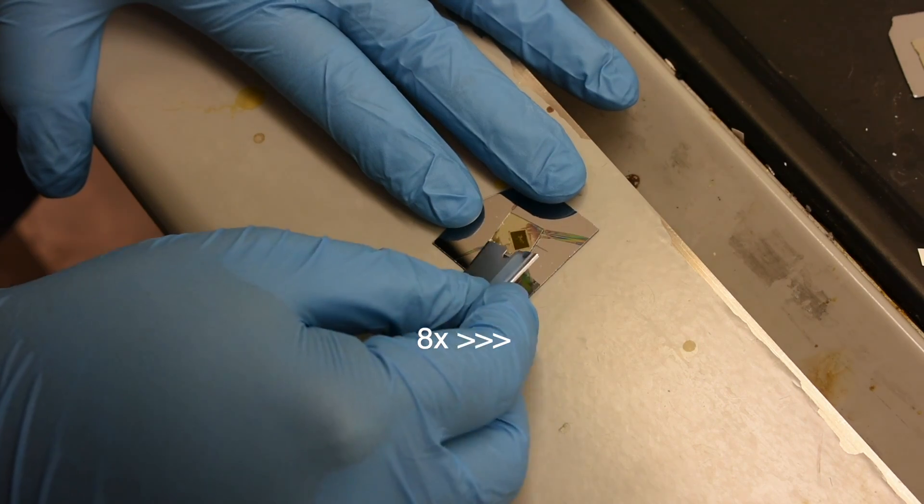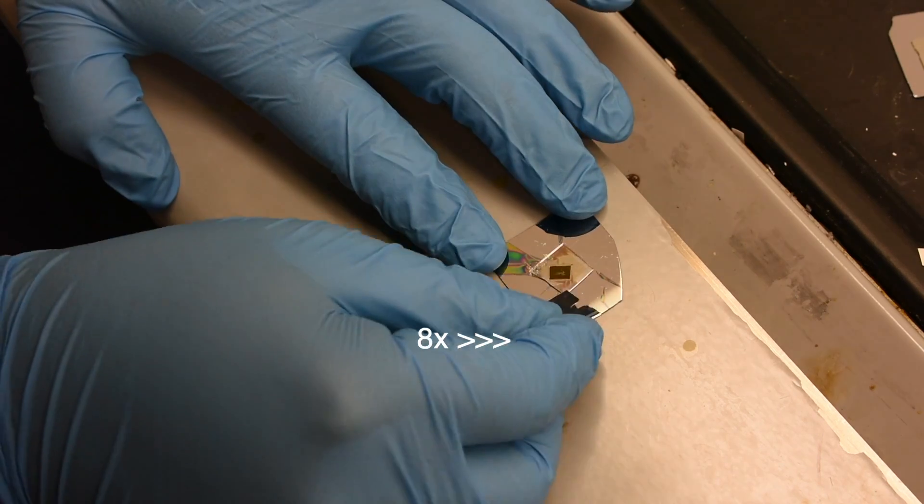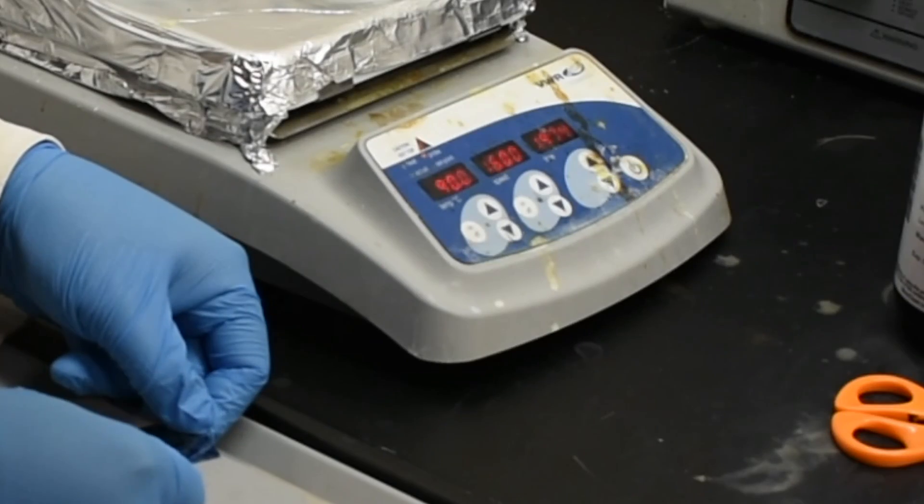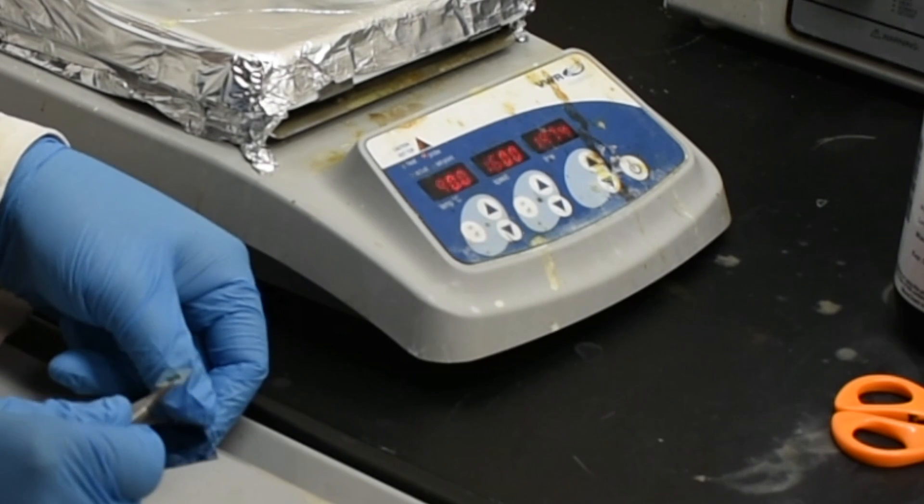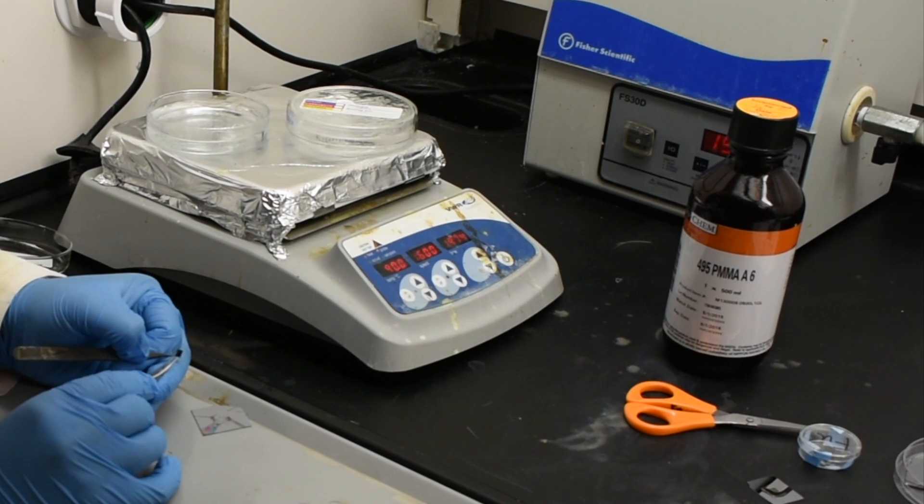The next day, we use a razor blade to shave PMMA from the perimeter of our sample. Next, we remove the carrier silicon wafer and the double-sided tape from our PMMA-coated sample.